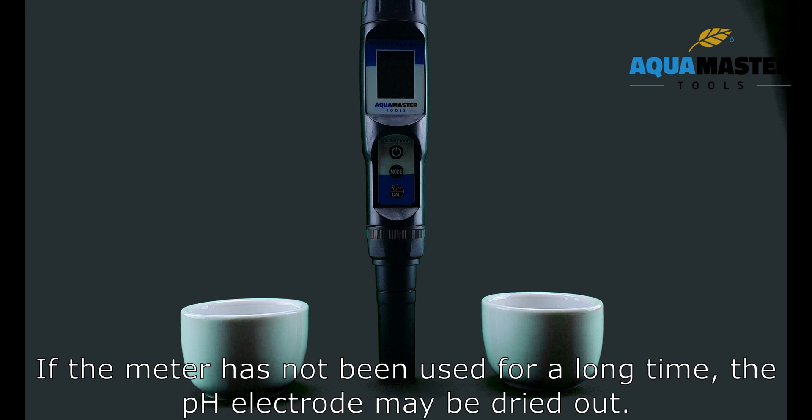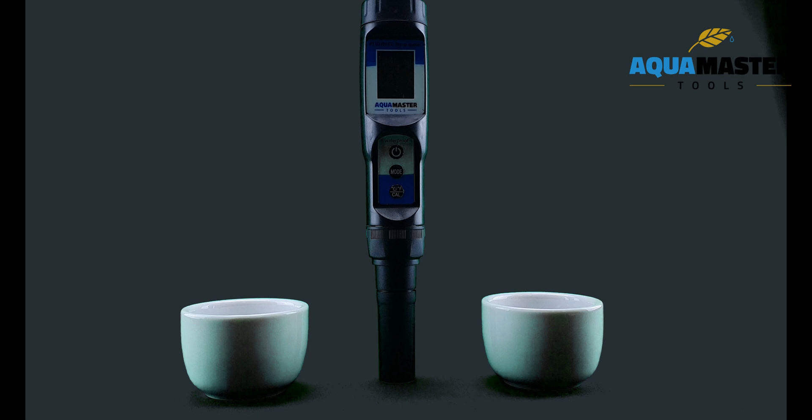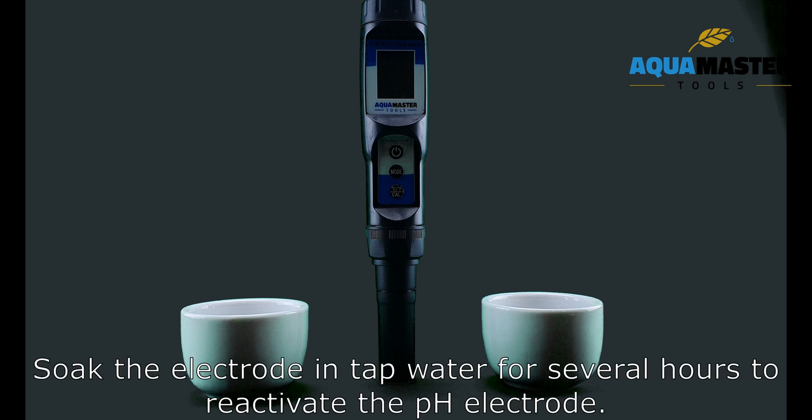If the meter has not been used for a long time, the PH electrode might be dried out. Soak the electrode in tap water for several hours to reactivate the PH electrode.